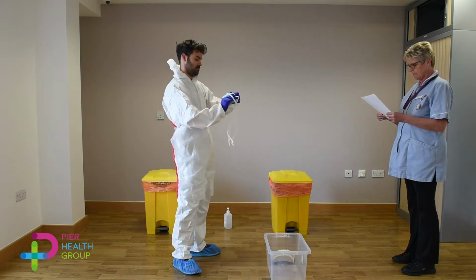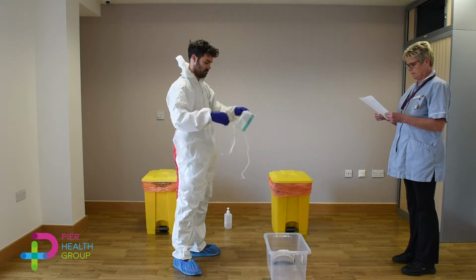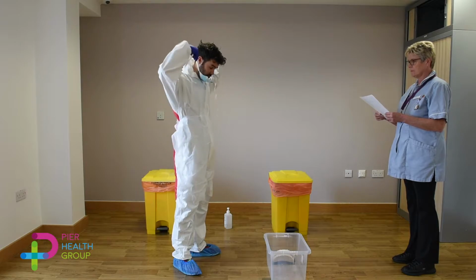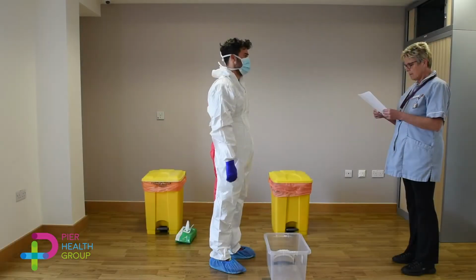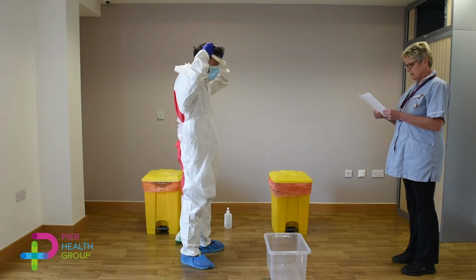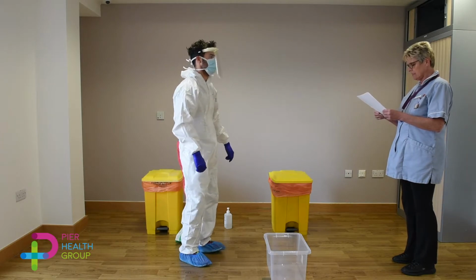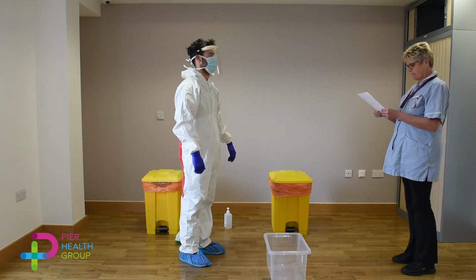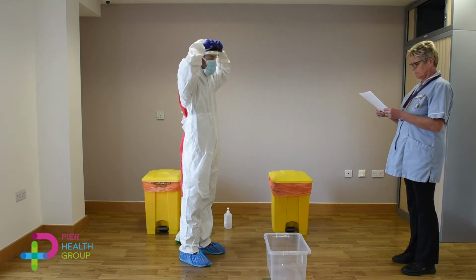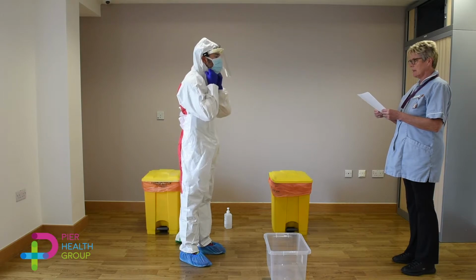Step 4. Place on FFP3 mask or droplet mask, ensuring a tight seal. Place face shield onto head, ensuring a comfortable fit. If wearing a suit, lift the hood over the rear of the face shield, ensuring a comfortable and snug fit.